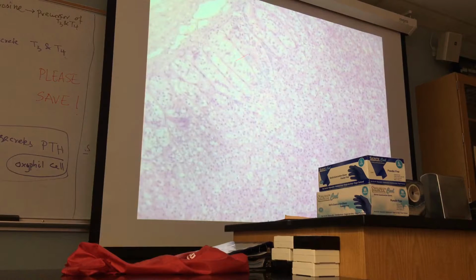Now this area is definitely not like this area. Can you see the difference? What is this structure called? Very good. Capsule of adrenal gland. This is zona glomerulosa and this is zona fasciculata.